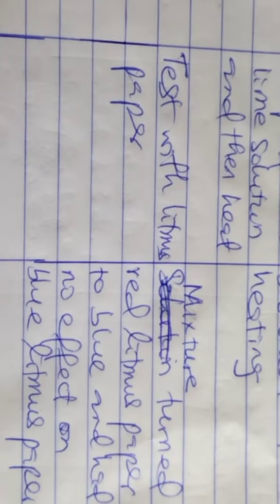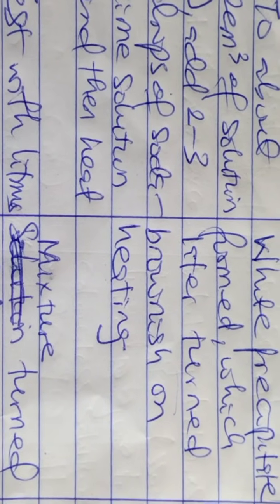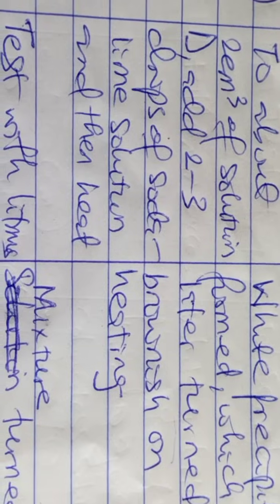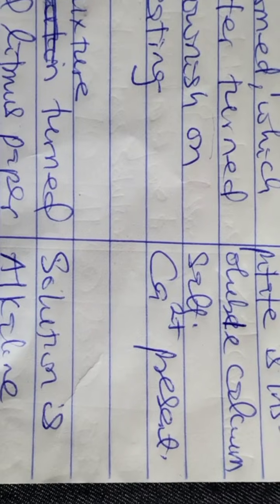So the explanation here is simple, that when solution D is heated with soda lime, the casein, that is a milk protein, will react with soda lime to form a white precipitate, which is the calcium ion. Okay? And so also we don't have time for that anyway. So that's the correct observation and inferences. Move to question 3.